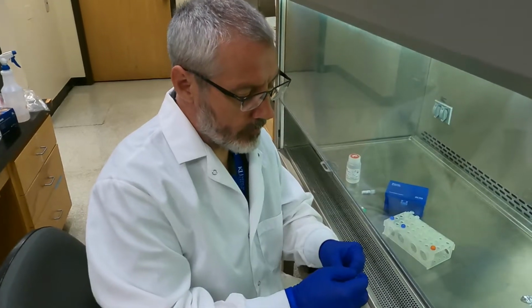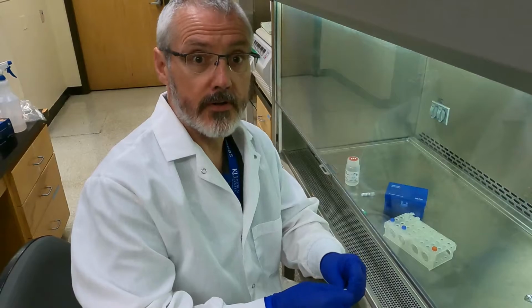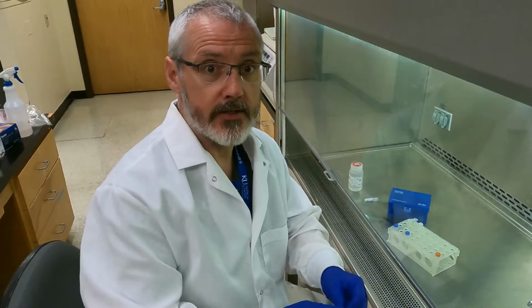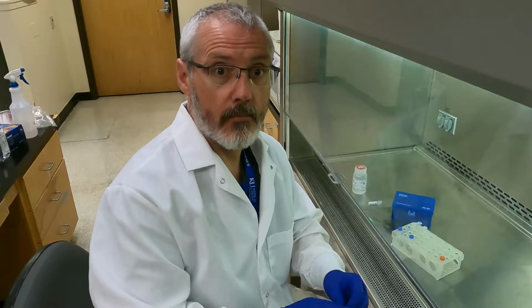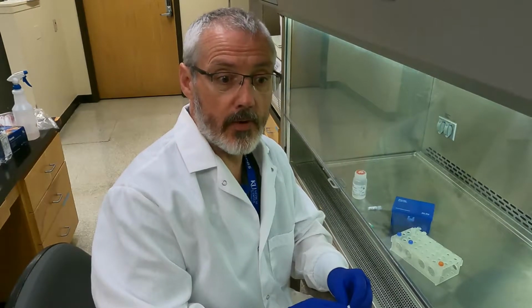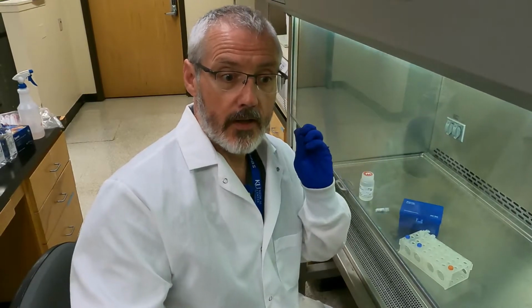Hi. So today we're going to make up some Cas12a CRISPRs and then complex them with Cas12a, and then just leave them for 20 minutes to make a complex. And then while we're doing that, we'll get our cells ready and put them at the right concentration, which is 5 times 10 to the 6 into buffer R, and then we'll electroporate the Cas12 CRISPR complex into the cells and then plate them out.